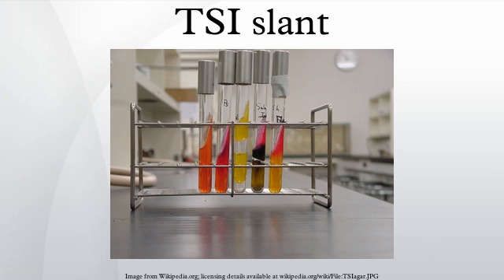Some bacteria utilize thiosulfate anion as a terminal electron acceptor, reducing it to sulfide. If this occurs, the newly formed hydrogen sulfide, H2S, reacts with ferrous sulfate in the medium to form ferrous sulfide, which is visible as a black precipitate. Examples of sulfide-producing bacteria include Salmonella, Proteus, Citrobacter and Edwardsiella species. The blackening of the medium is almost always observed in the butt of the medium.